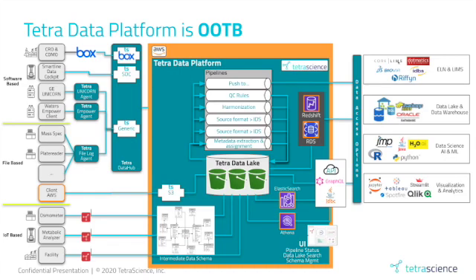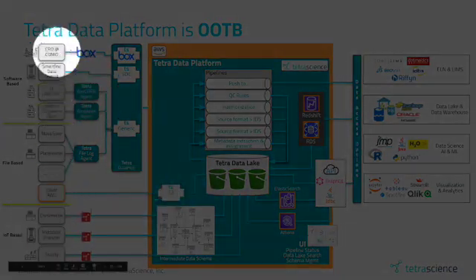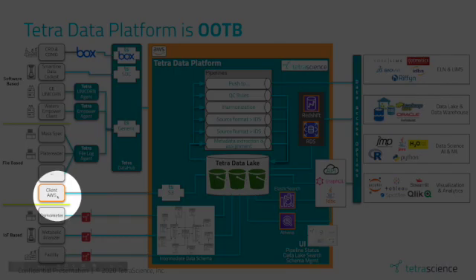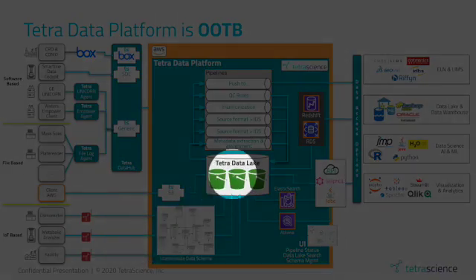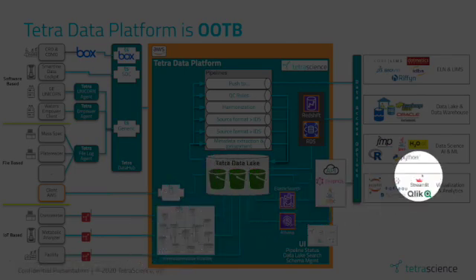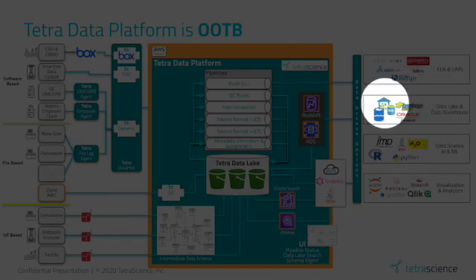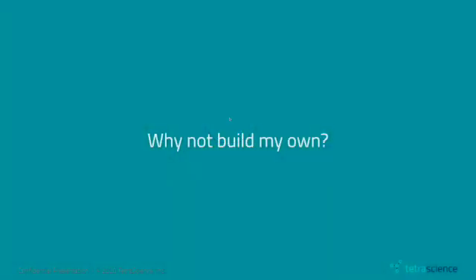Little overview, we'll dig into this more as we go, but the point of this slide is to show that on the left-hand side, we have a lot of different instruments, software, and IoT devices that we're being asked to integrate with. We want to get that data into a data lake where we have a harmonized data model that allows us to then analyze that information through various tools and capabilities. To get the data into the right formats, we have a number of pipelines and metadata extraction utilities, QC rules, and the ability to push that information out.